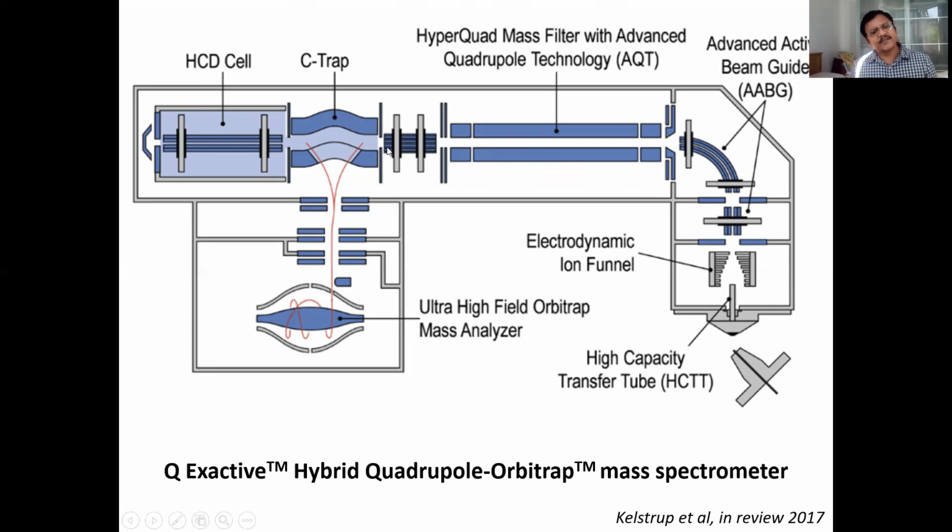The selected peptides transfer to the C-trap, where we collect a certain set of peptides. For example, if peptides are identical from all four samples, you will get that bunch of peptides from all four in the C-trap, because they are identical and pass at the same time. They wait there for a moment, and then they are transferred to the Orbitrap mass analyzer.